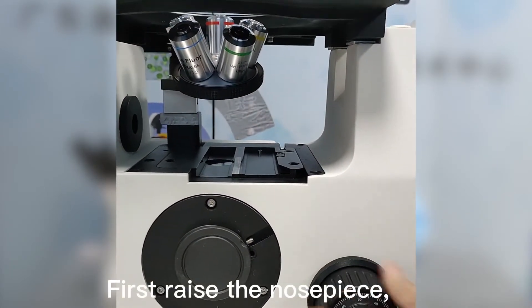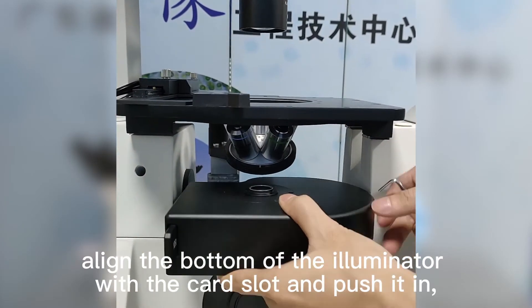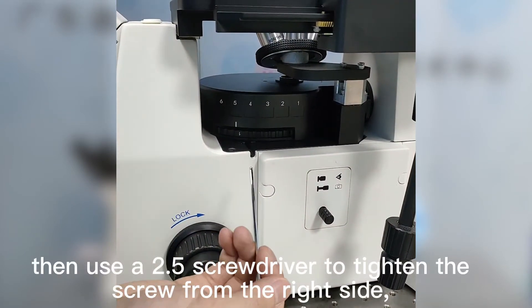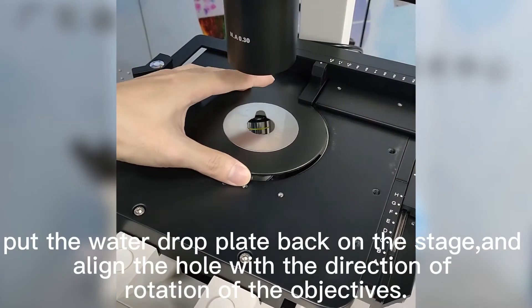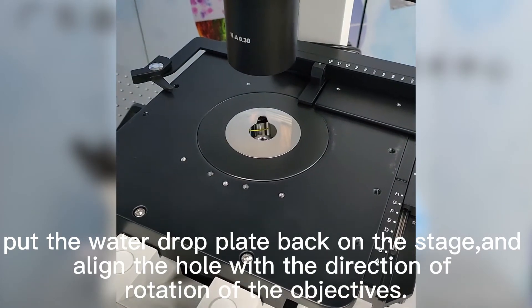First, raise the nose piece. Align the bottom of the illuminator with the card slot and push it in. Then use a 2.5 screwdriver to tighten the screw from the right side. Put the water drop plate back on the stage and align the hole with the direction of rotation of the objectives.